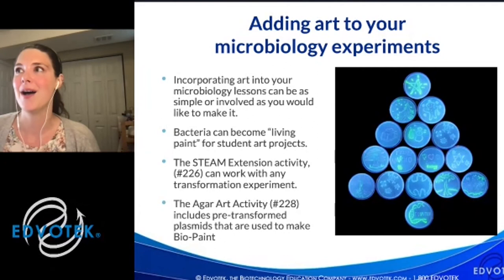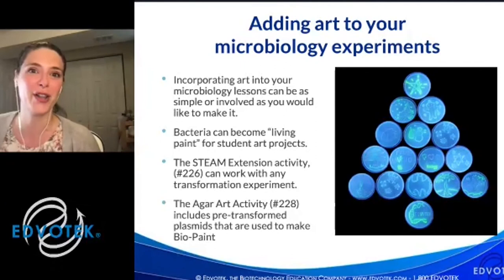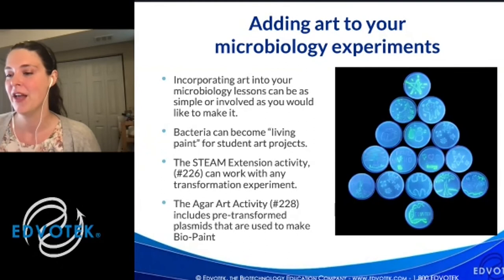I will say that our production staff might not be happy with that, because we make all of these beads in-house, and we might be making a little bit more work for them. But in terms of the chromogenic plasmids, I would love if my blue was a little darker. But we're working on that.